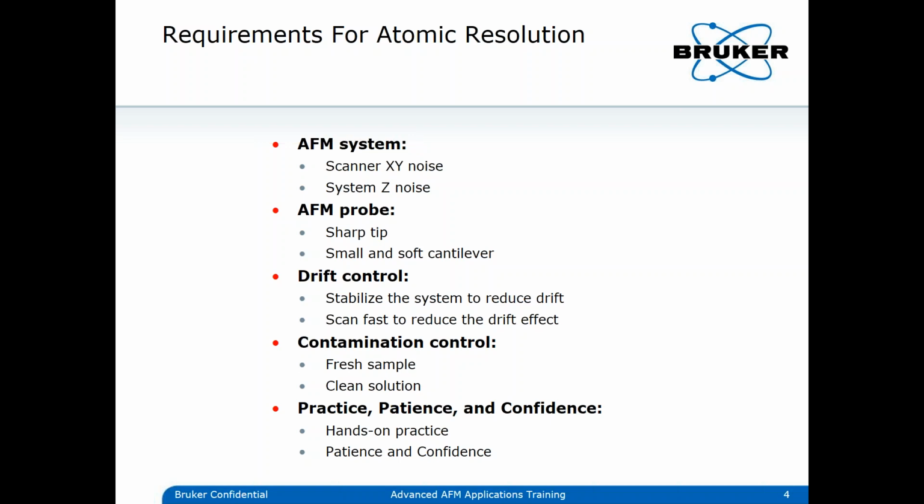The other thing then is the contamination control. So you have to have a fresh sample and a clean solution if you work in liquid. I'm showing later some images on that.